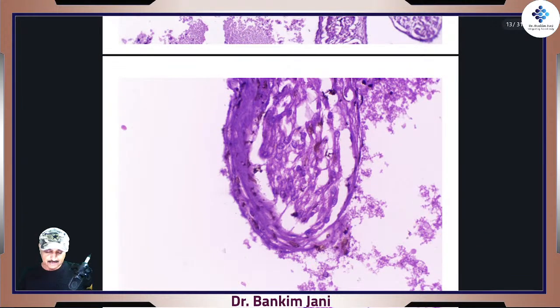And here it is. See the wall. You see all these flat black things, these are nuclei. So this is how they look in reality.